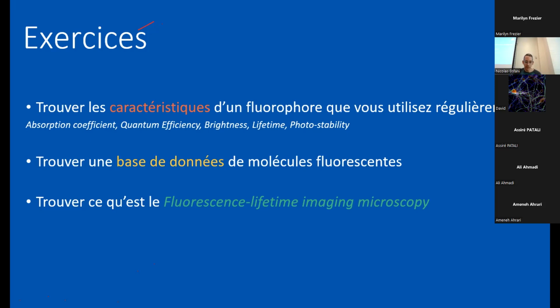So for those of you on Zoom, I want you to open your favorite browser and try to find the absorption coefficient and the quantum efficiency, at least for your fluorophore, and you can type it into the chat. I'm going to do that for FITC.